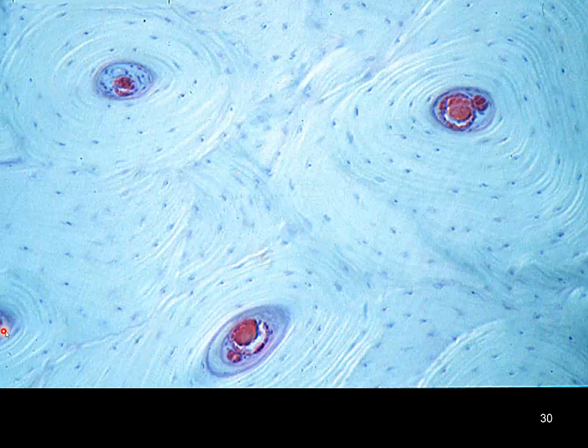Just a hint of a Haversian system here, and possibly cementing line in this location. So this is our osteon and the circumferential lamellae of our osteon. But then again, we have some lamellae that are present not associated with any of these intact systems, and these are going to be our interstitial lamellae in between our osteons.